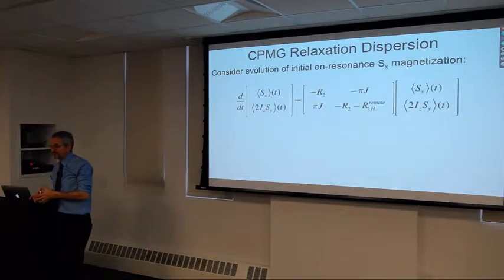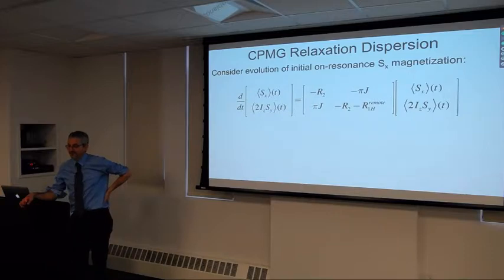And deuteration isn't as helpful as you think, in part because even if you deuterate to high level, when you put the protein back into water in order to protonate the amides, you also protonate all the hydroxyls and the side chain amide groups.